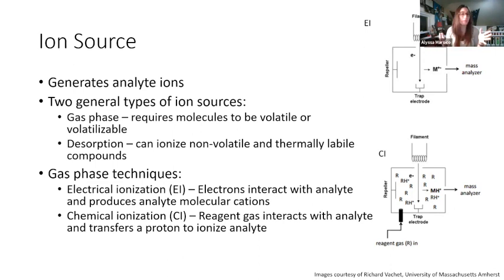If you ever get a sample of anything, or in a class you're looking at online resources to find a mass spectrum of cocaine to compare a sample to, or anything that you got data for in a class, you need to make sure you get the mass spectrum for the specific ion source that you used to analyze that sample. And now I won't go into the nitty gritty about how the chemistry works to ionize these samples.